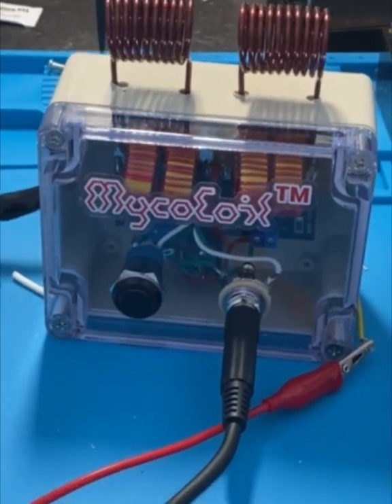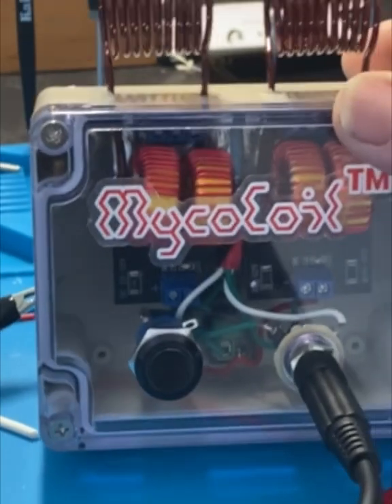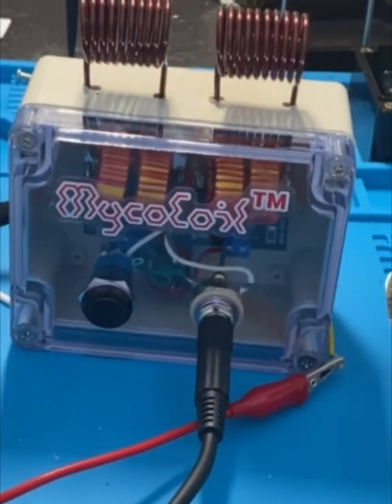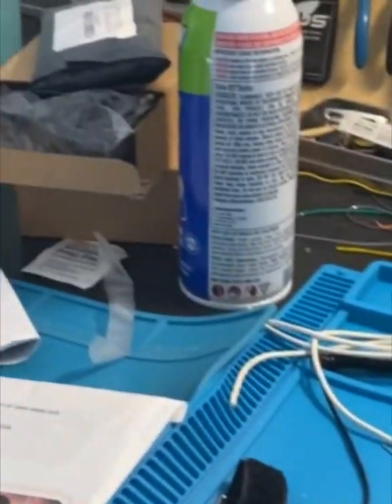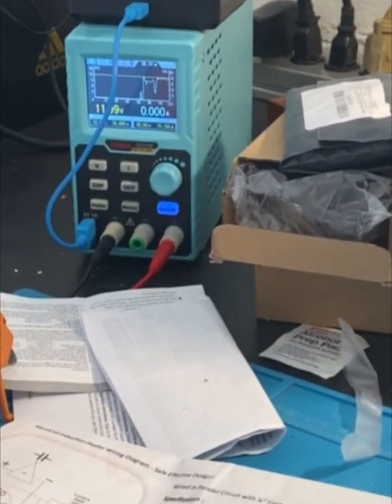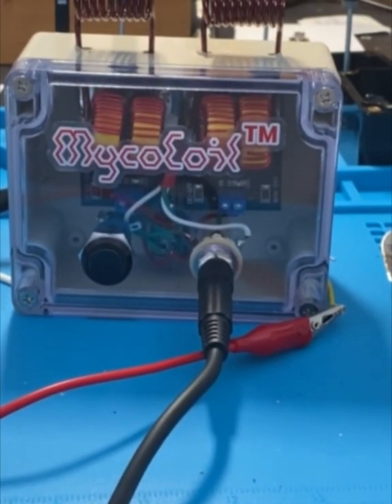That's just a quick product demo — it seems to be working good. I do have to tweak it a little more. I hit some issues soldering the coils onto the boards because I had to cut them shorter and there was flux on there, so I had to make some abrasions with the Dremel tool just to get it to stick. There are a couple things I need to do better. I'll naturally keep this one for myself in the lab and keep testing it, then I'll build another one — cleaner — and then I can offer it.